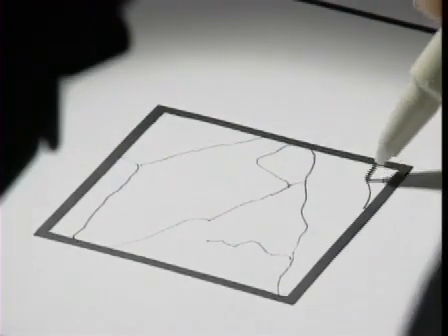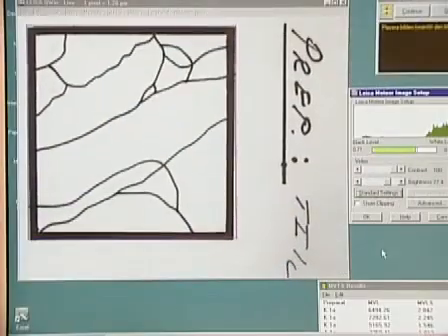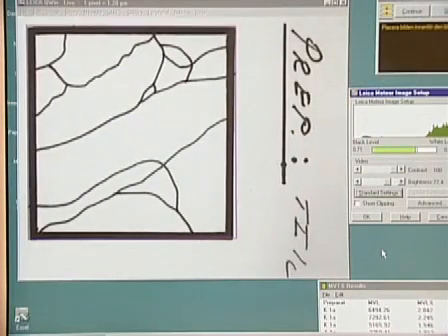The image of each view field is transferred to a digitalized image in an image analyzer, and every vessel in the digitalized image is then reduced to a thickness of 1 pixel.